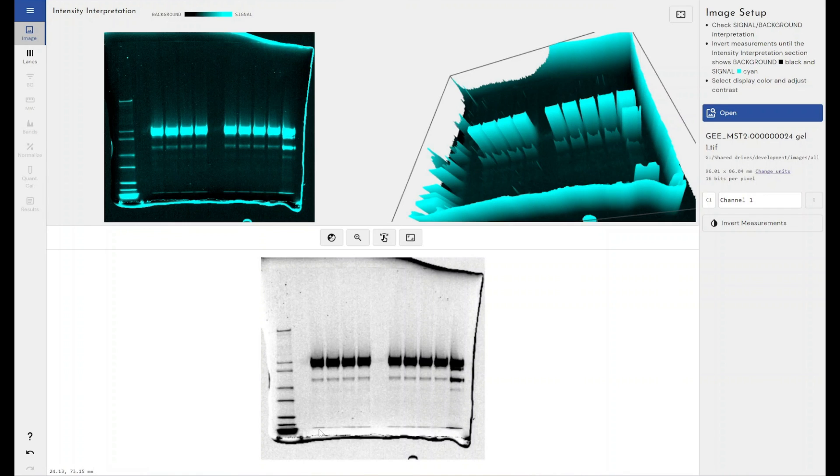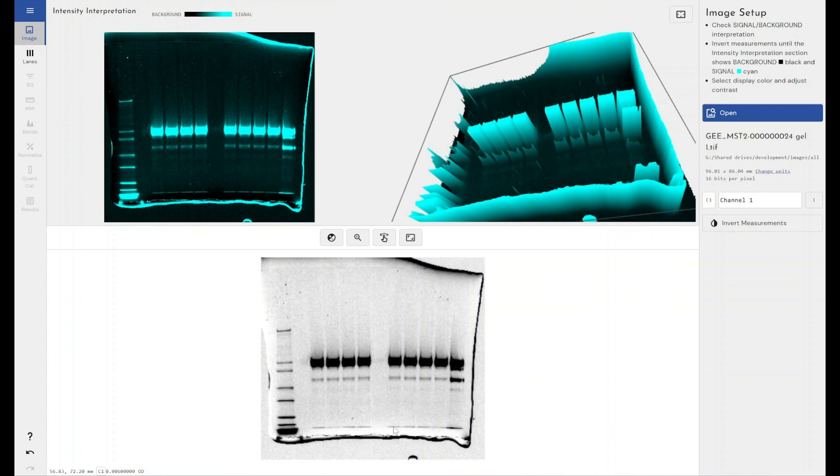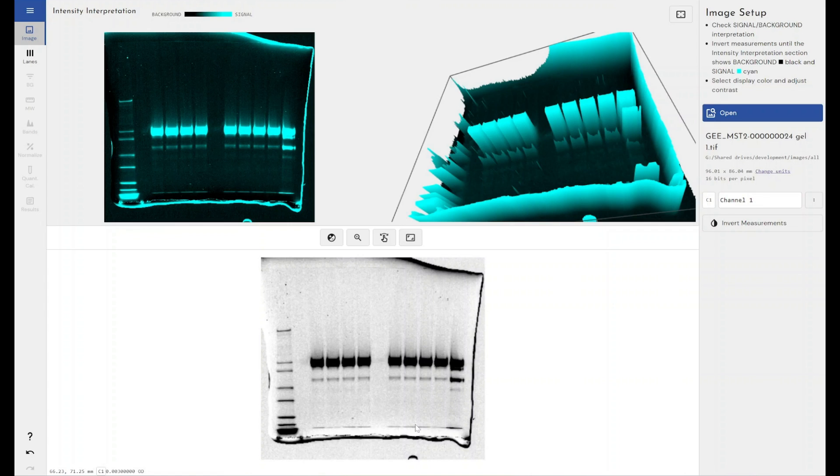So the dye front acts as a visual indicator of where our lane ends and that is the theoretical maximum of how far our protein or our sample could have moved if it was incredibly tiny. So I'm using this image here which isn't the best image but it does have a pretty visible dye front as part of the image, not all of them do.